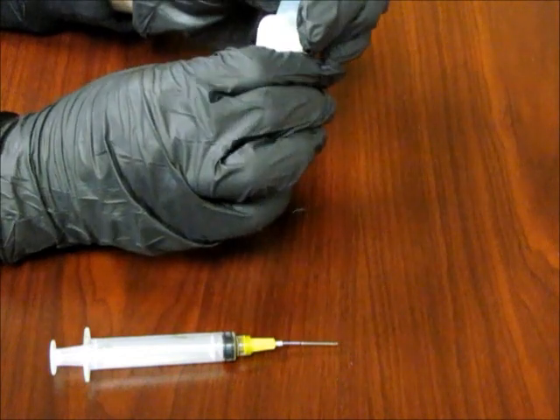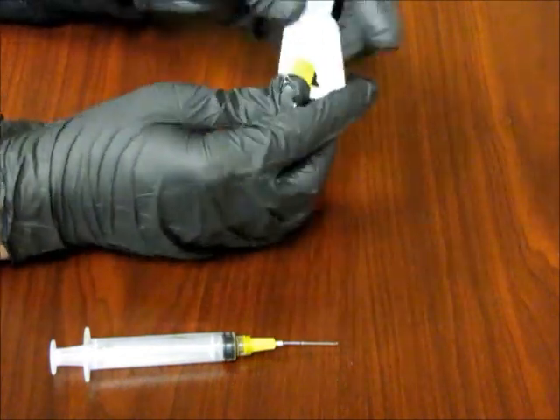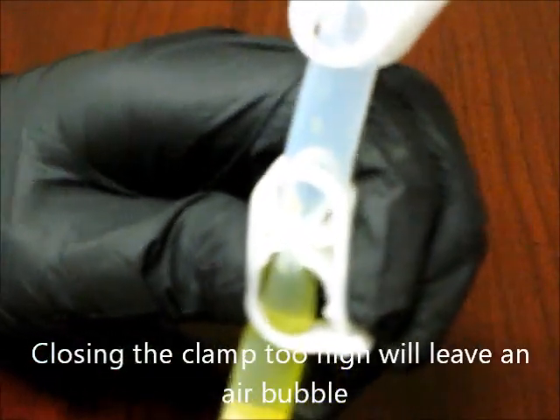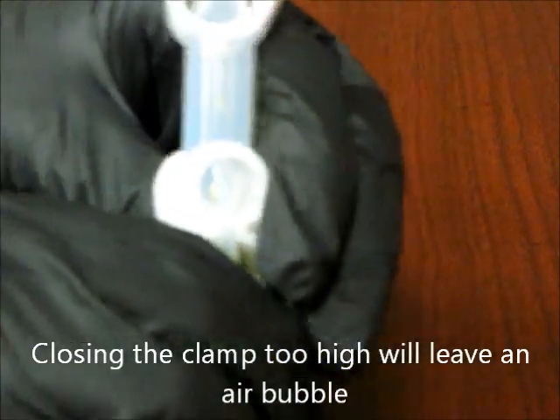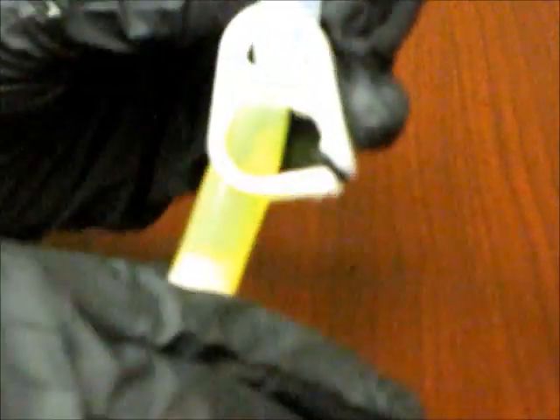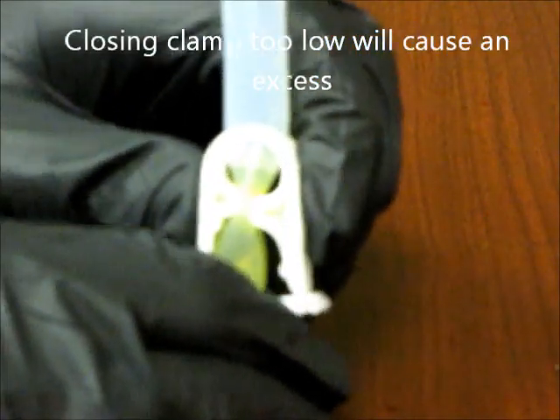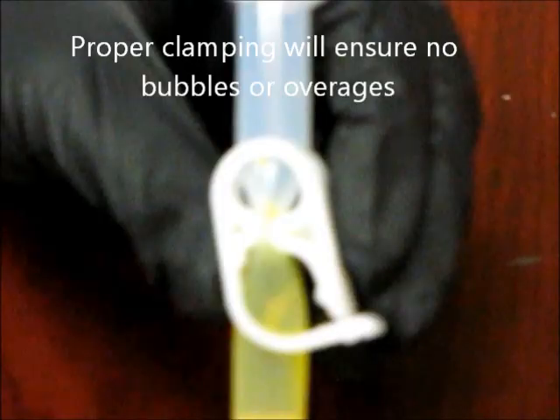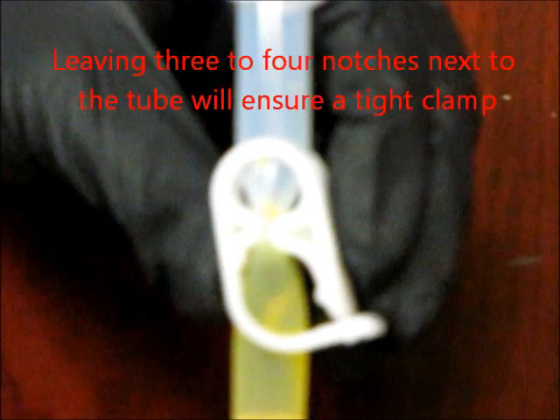This may take several attempts. Closing the clamp too high will leave an air bubble. Closing it too low will leave excess fluid on top. In each case, adjust the clamp until you get a proper clamp. Proper clamping will ensure no bubbles and no overages. Leaving three to four notches next to the tube will ensure a good tight clamp.